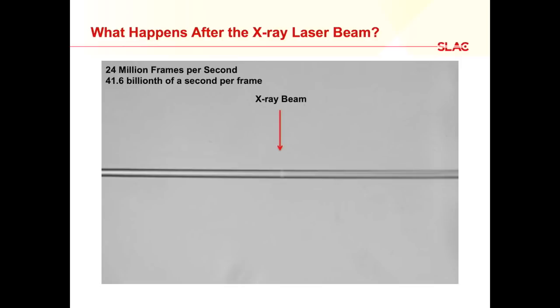As I said, the X-rays come in, they completely obliterate the sample, but amazingly, you still have time to take the measurement that you want, even though this happens after your measurement. So this is a liquid jet that you'll see that flows from right to left. This little white line here is actually a flash of light because the jet gets so hot.